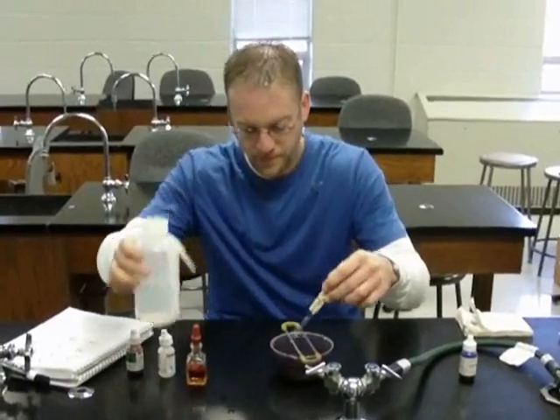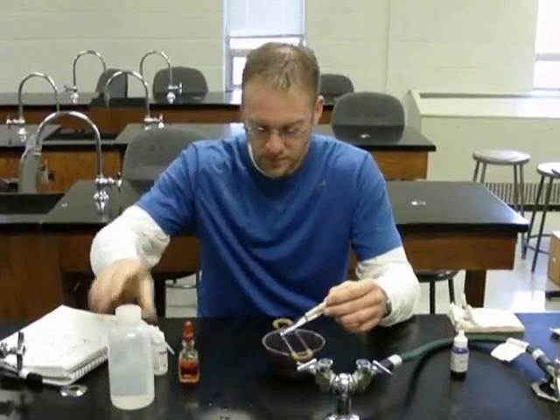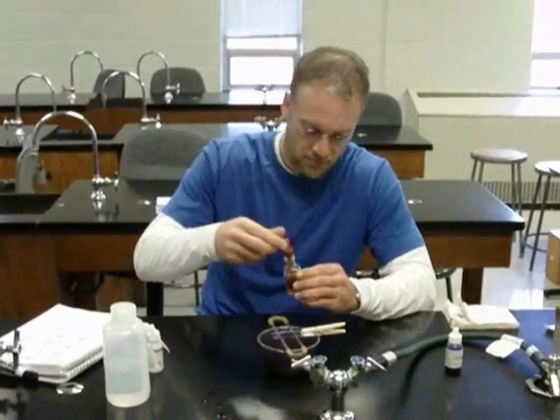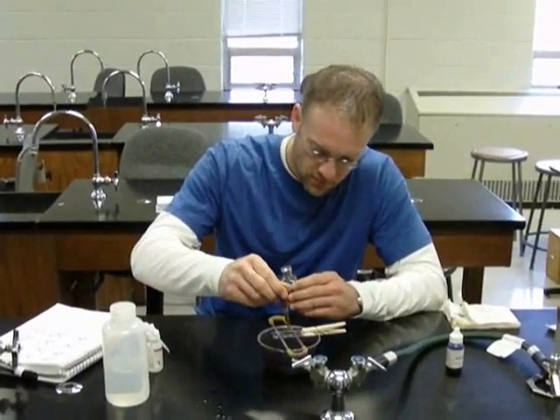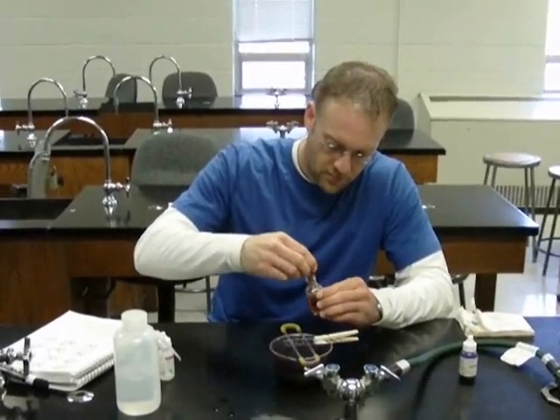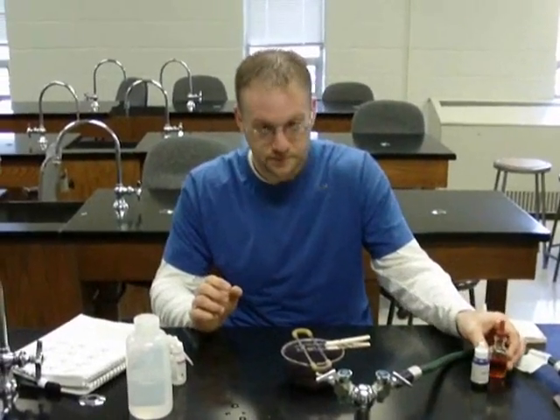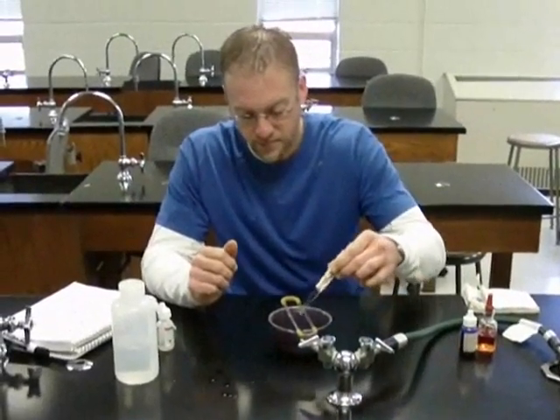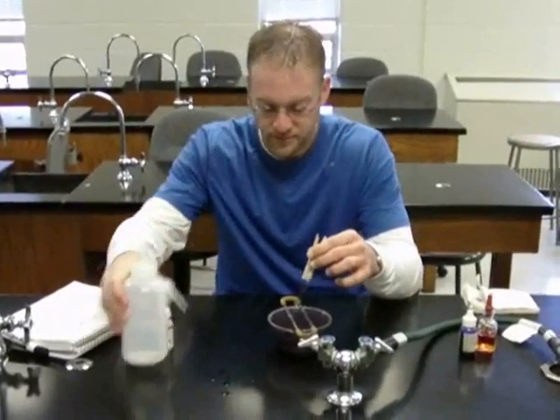He's done rinsing and now he's going to apply the Gram's iodine solution to fix the stain. He's going to let that react for about 30 to 60 seconds. It's been 60 seconds. Now Jason is going to rinse with distilled water.